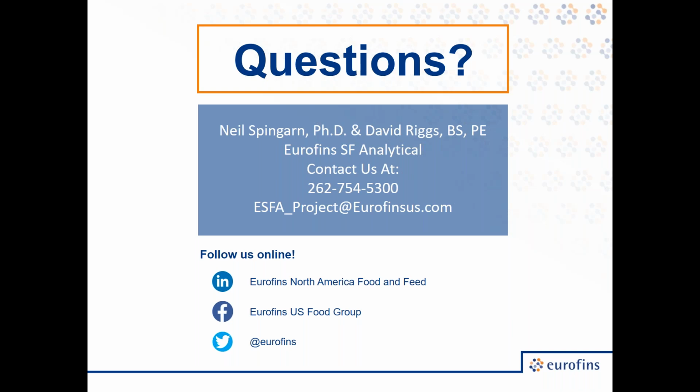They actually have a pretty wide variety depending on how old their system is. Typically, they can see 1/10 of a millimeter and up if they're properly correlated and it's a relatively modern machine. But older packing lines might not see anything smaller than a millimeter, sometimes even larger. The best systems can pick up metallic particles that are 1/10 millimeter.